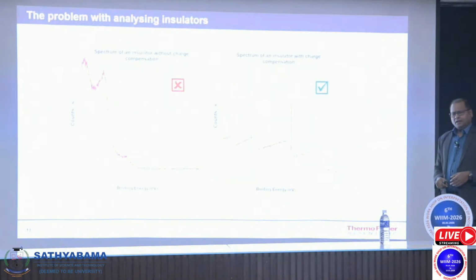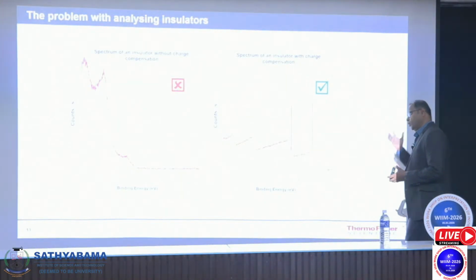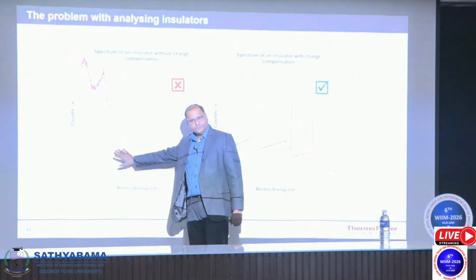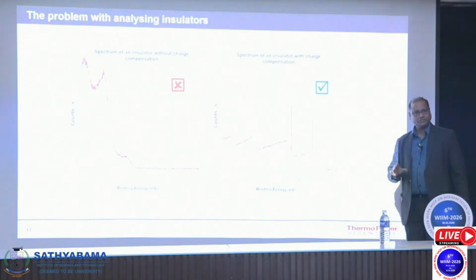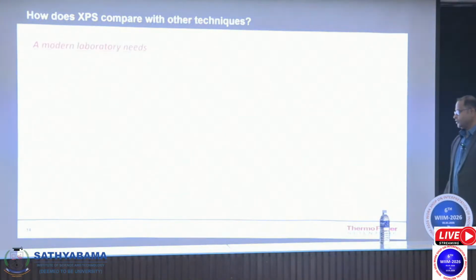Now stepping forward, a question that comes to us is, am I able to handle every kind of sample? For example, I might have a conductive sample, or I might have a non-conductive sample. Am I able to analyze both of them? When you look into the olden day XPS instruments, their charge neutralization or ability to handle non-conductive samples was very poor. So recording useful spectra with the olden day instruments was very, very difficult. But with the modern day instruments, you have very good charge neutralization, which comes as standard, and you can record spectra irrespective of whether the sample is conductive or non-conductive.